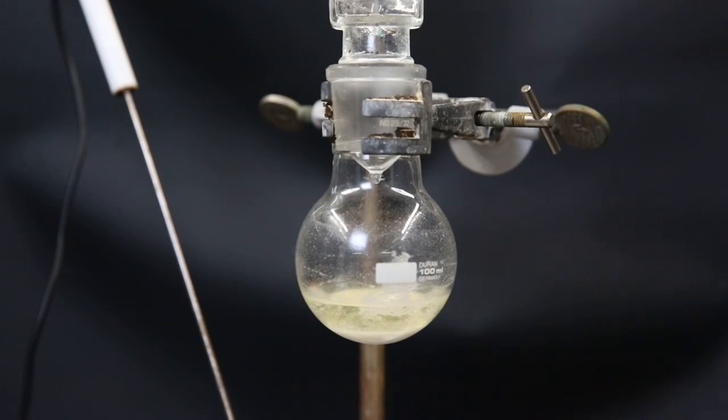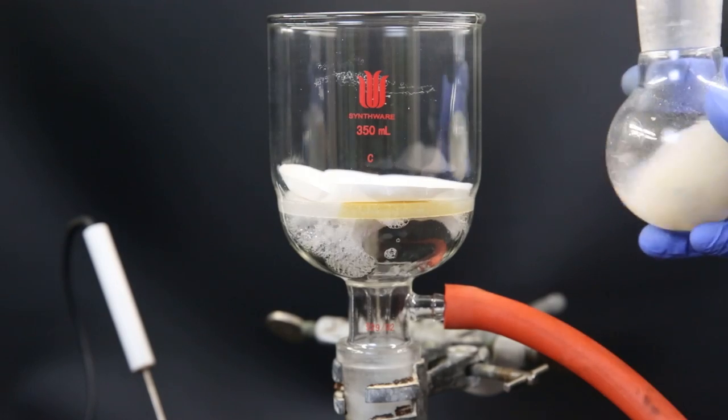After stirring it for a while, we can see a white solid at the bottom and the solvent has become yellow. To get it out, I set it up for a vacuum filtration.